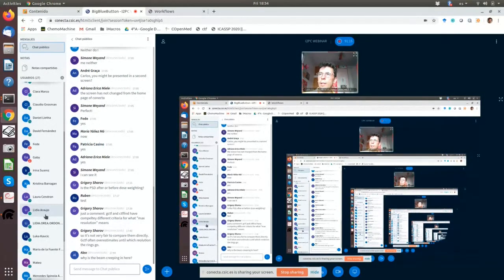Yeah, very likely Scipion relies on XMIPP for reading images, reading metadata, and so on. And maybe if the metadata has a problem or the image or whatever, for some internal operations Scipion is using XMIPP. So even if you're using a plugin of Relion, at some intermediate steps, it might be using XMIPP for some small operation. Interesting, I didn't know. Yes, it complained about a 4x4 matrix which is not invertible. So that must be something in the metadata. And this was data that initially was exported from CryoSPARC and imported in.